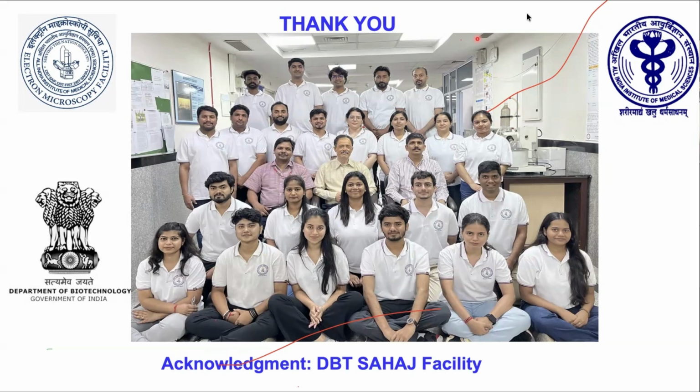But if you want to see inside the whole cell, one complete cell, and where your molecules are, then you have to go with slice and view in cryo condition. If it's larger in size, better to use room temperature slice and view first, because the resolution and contrast are better here. Directly you can image it. But for the cryo condition, you have to do tomogram generation and everything, and then finally you could see that particular molecule. Okay. Thank you, sir.